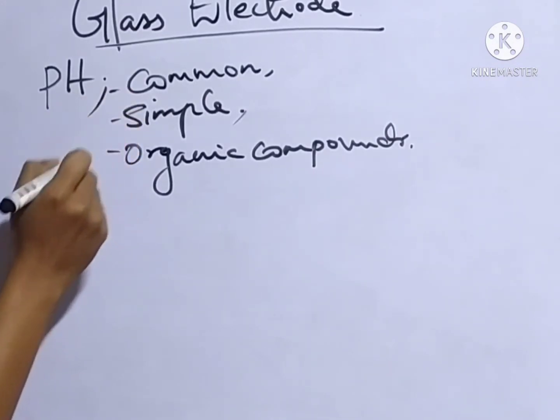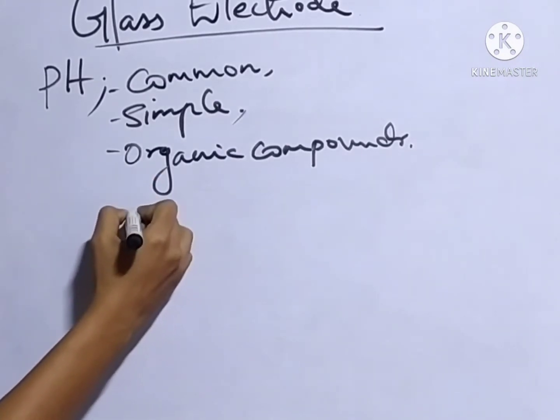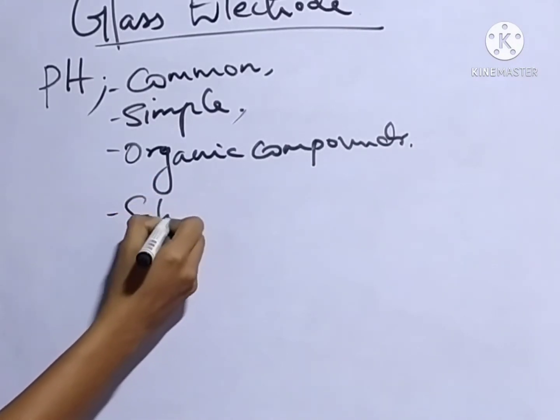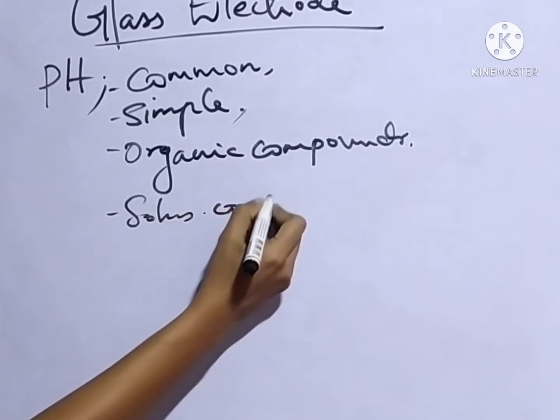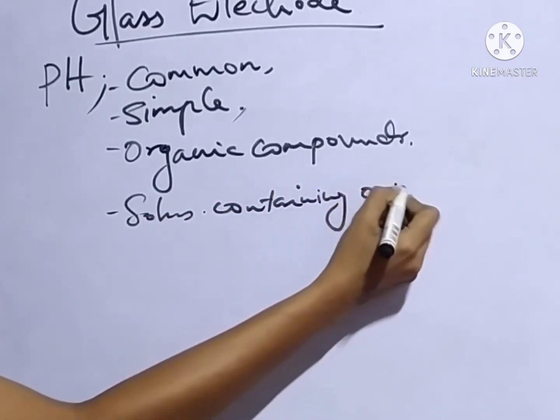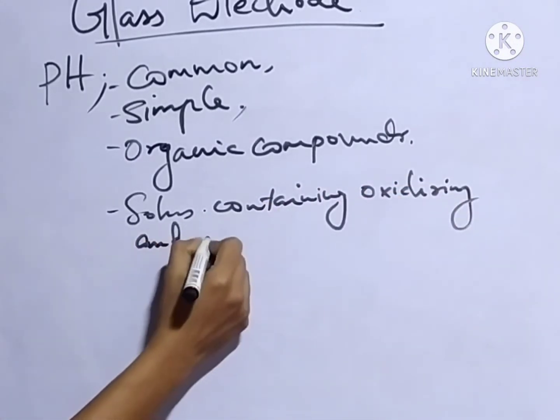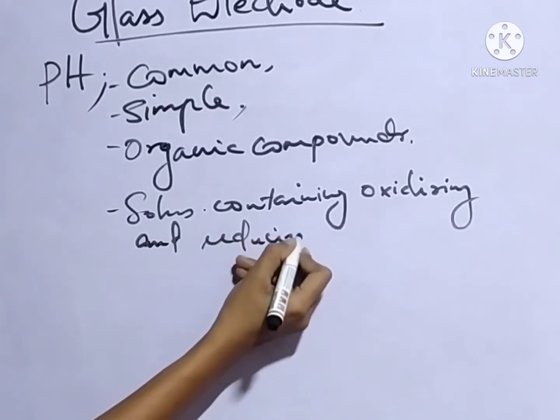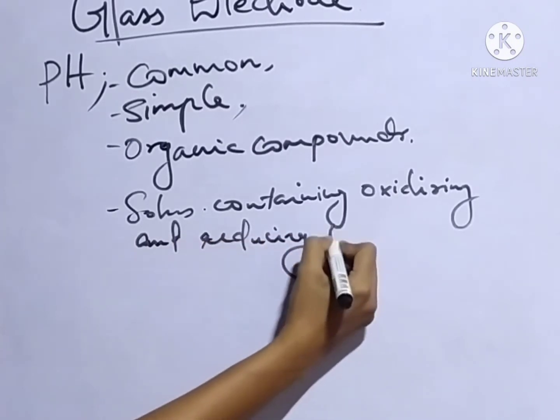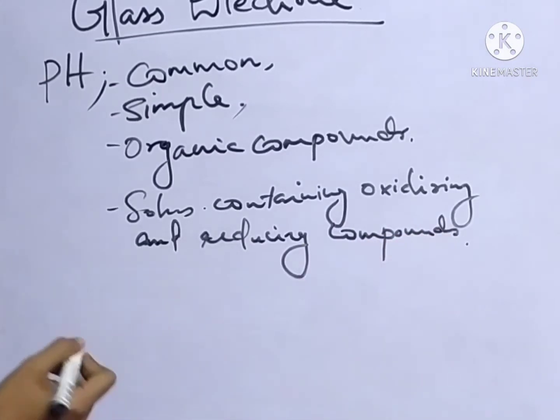And it is also used for the solutions containing oxidizing and reducing compounds. Okay.